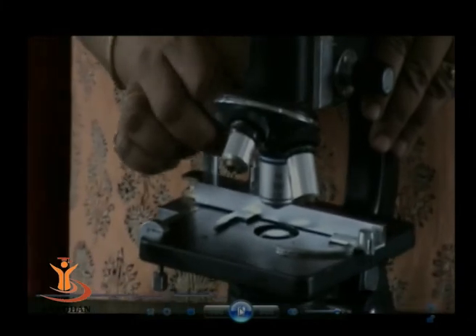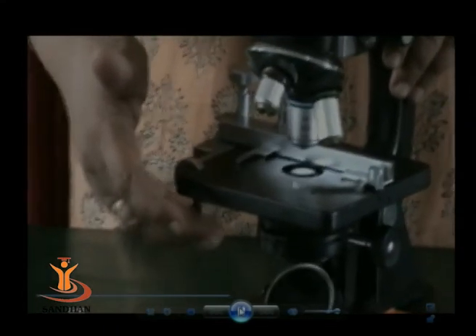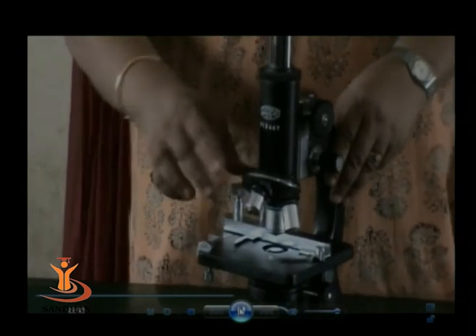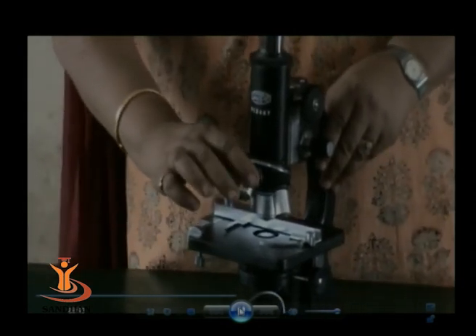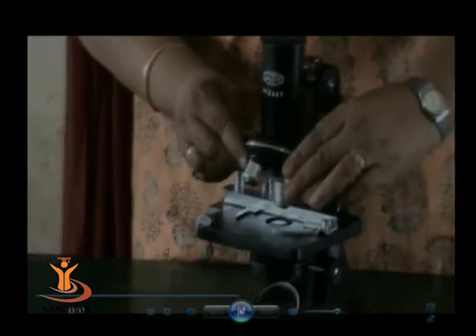So the light rays first fall on the mirror, they enter the condenser lens, then they pass through the object, and then they enter the objective lens. Here you can see there are three objectives. This is the low power objective, you can see.